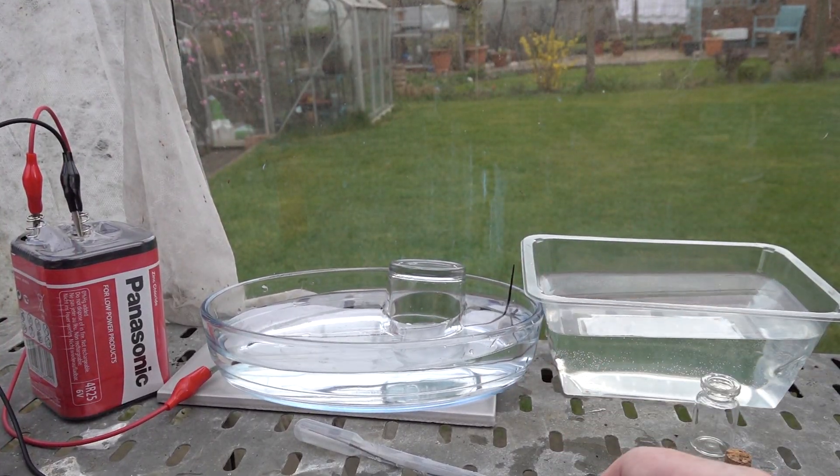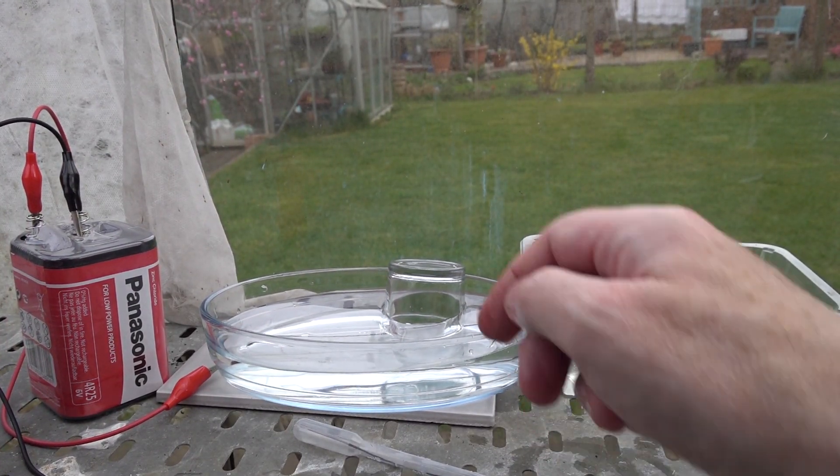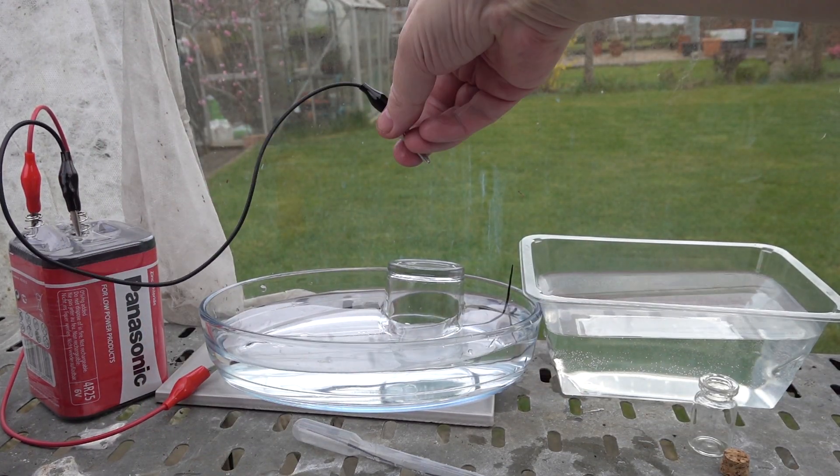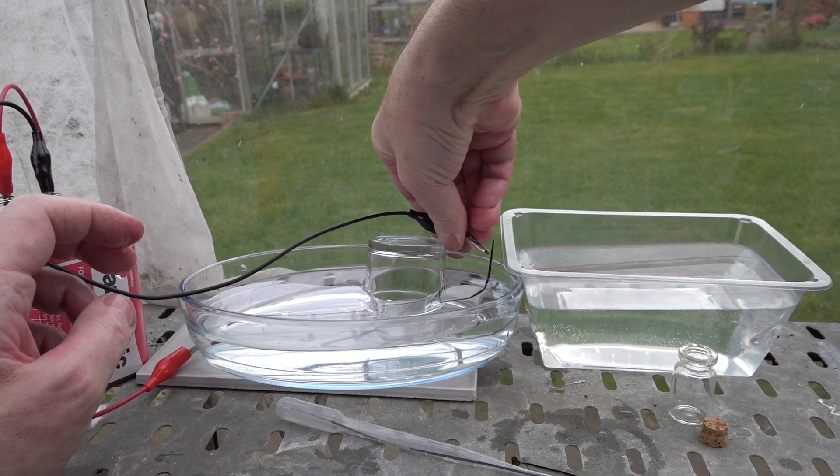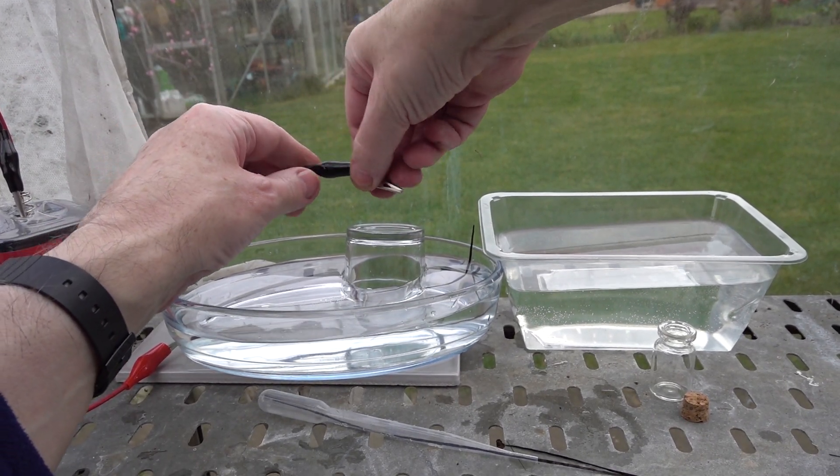All you need to do is connect up the electrode using a standard crocodile clip and a power supply. Here I've got a six volt battery. Away we go, or well, will be when we've got two electrodes set up.